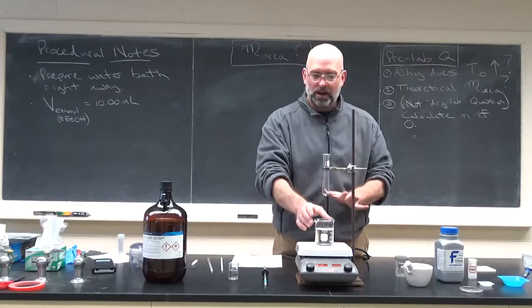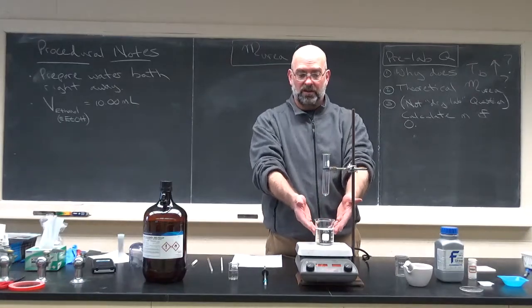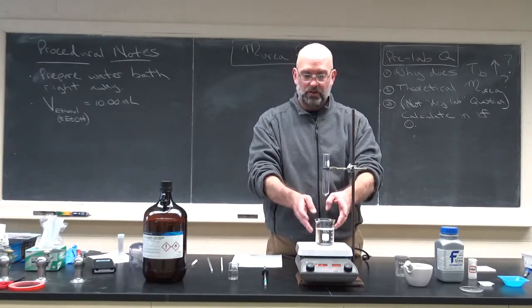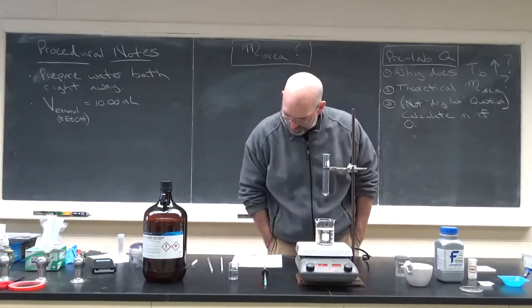Okay, so you want a 250 milliliter beaker and a water bath. This can just be tap water, by the way. We're not using this as part of the experiment. It's just there as a heating source. Fill it maybe two-thirds full, so that when you put the test tube in there, it doesn't overflow. But that wouldn't be a disaster if it did.